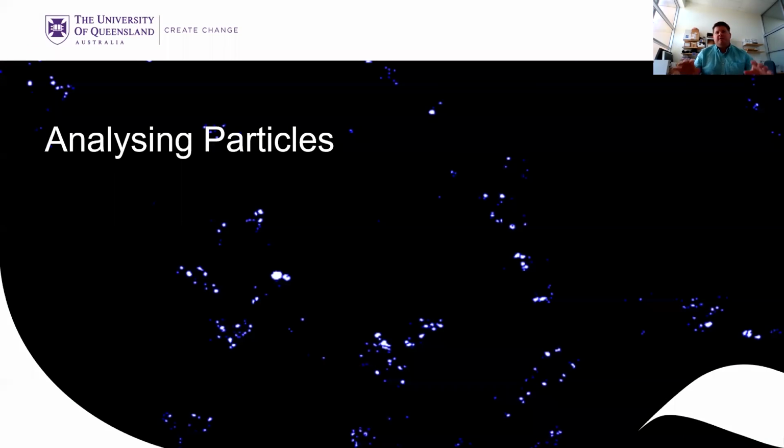Okay, so the last kind of step then is to get it from that binary mask into a big list of all the objects. So then you can go and measure them individually, or you can take the areas of those objects and go to another channel and measure them or something. And so you want to end up with particles, and the word particle here could be cells, bacteria, objects, basically, in your image.